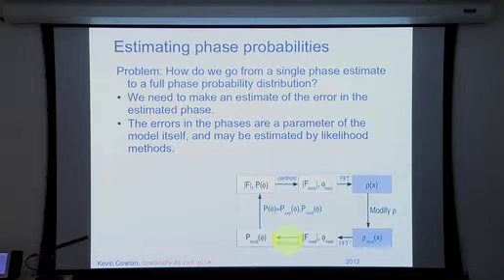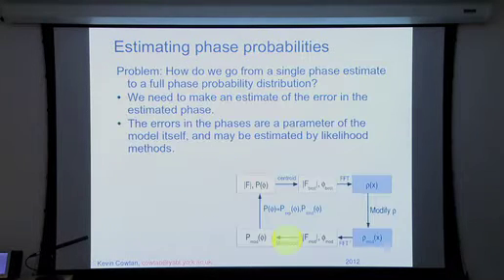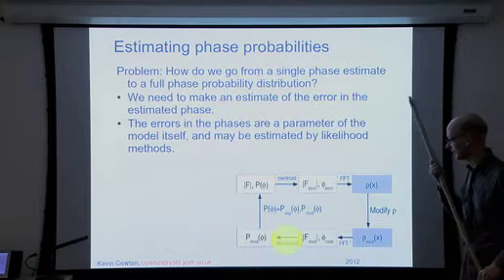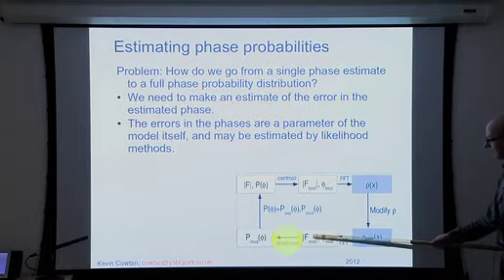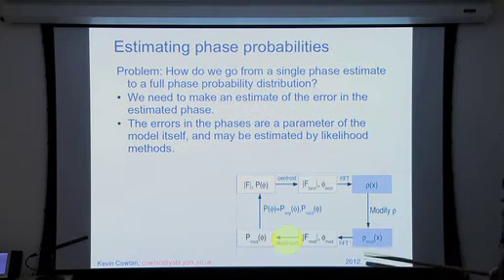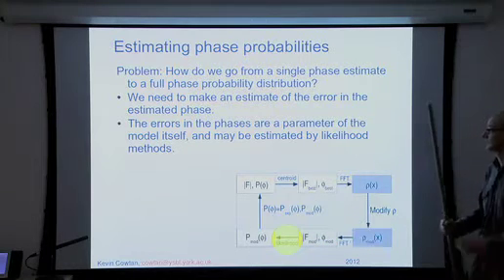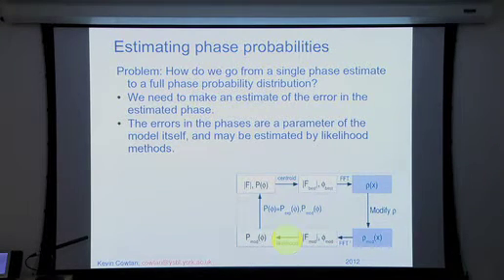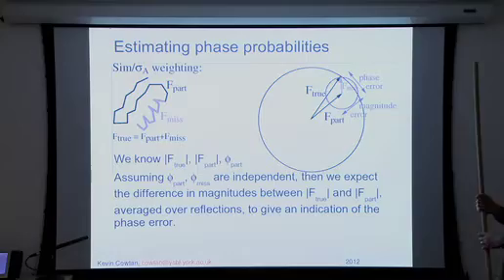Right. Do we want to see? This is a slightly more advanced concept, but it has relation to refinement, so I'll mention it briefly, and the more you hear it, the more you'll understand it, hopefully. How do we go from an amplitude and phase that we get from our modified map, once we've finished improving it, to a phase probability distribution? Well, this is a likelihood calculation, and you'll hear about lots of those in crystallography.